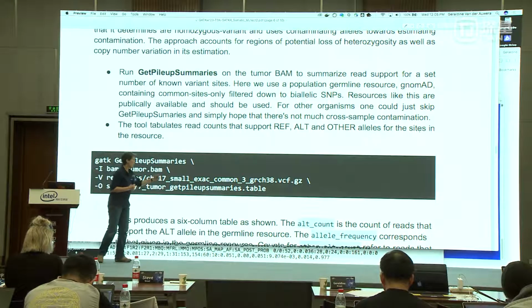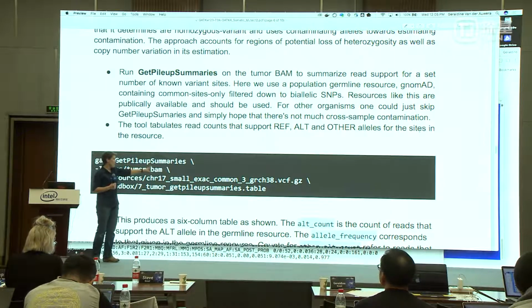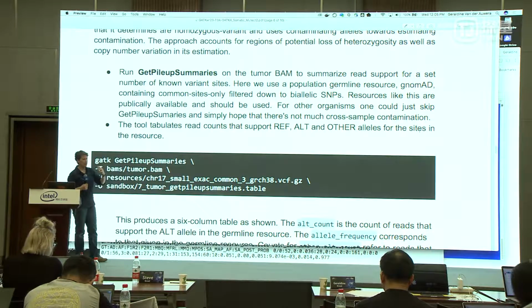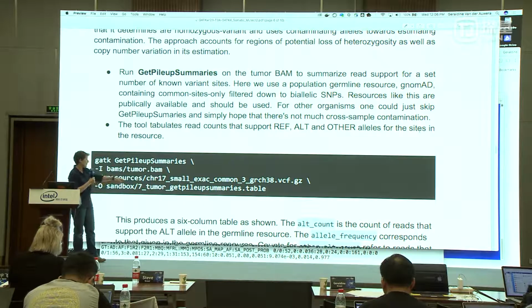Okay, and we're going to be looking specifically for homozygous variant sites. So we're going to look for each of these sites: is our case sample homozygous variant? For those where we find that they're homozygous variants, based on showing at least, I think, 80% of the allele frequency is a variant allele, we're going to choose those and run on those sites in the next step. And what we're going to extract is going to be the read counts, the allele counts at those sites.